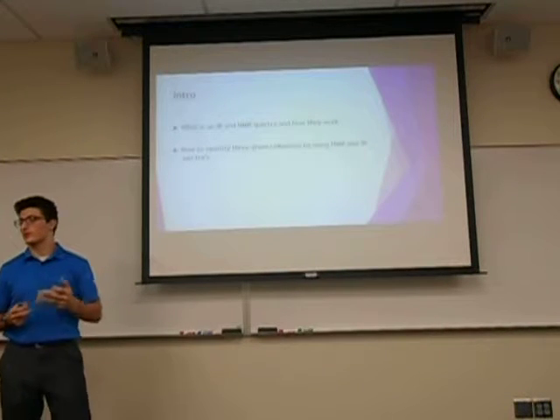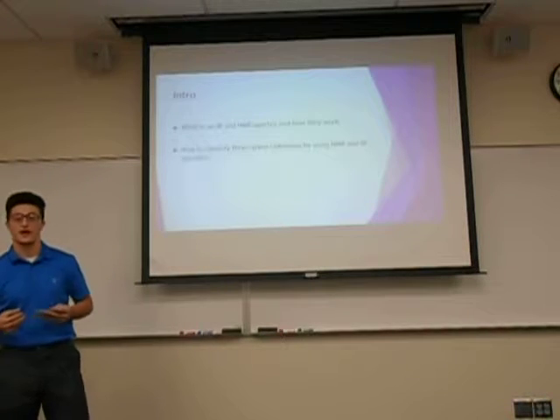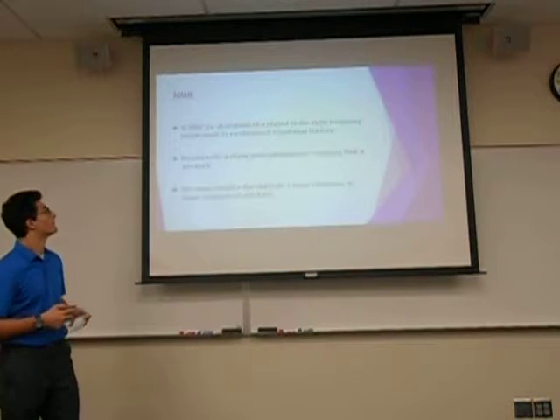Alright, so the intro. What you'll be learning throughout this presentation is what an IR and NMR are, how to examine them and how to use them, and also how to use them to identify your three unknowns that are given throughout the lab.